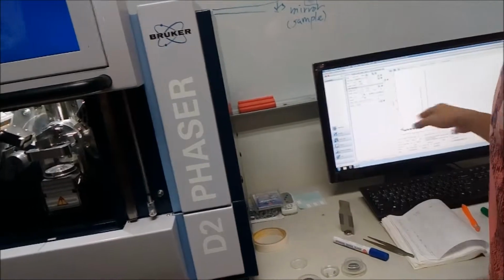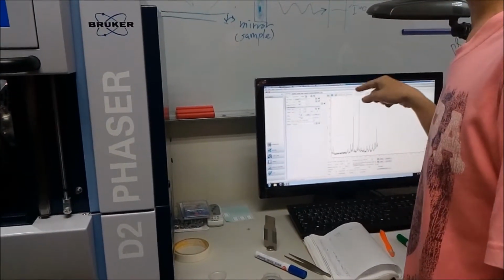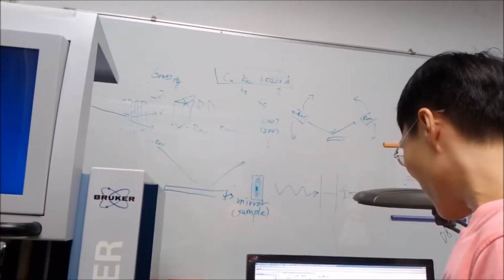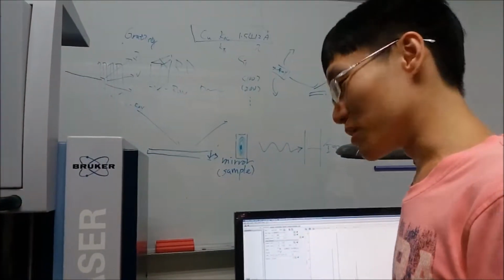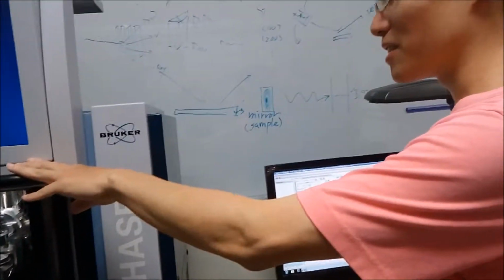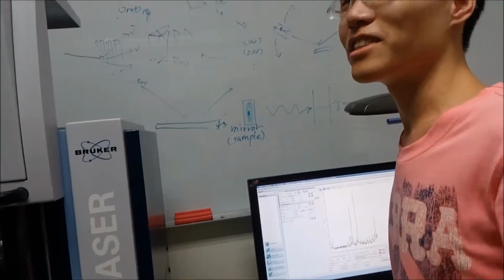if that is not flat, the peak will be very broad. It will go broad, right, but now we're going to very broad. You can see the difference because it's very small. If you want to do a very careful experiment, you need to use flat. It's okay, but I don't know what this is, so just test it. Just close to flat is okay.